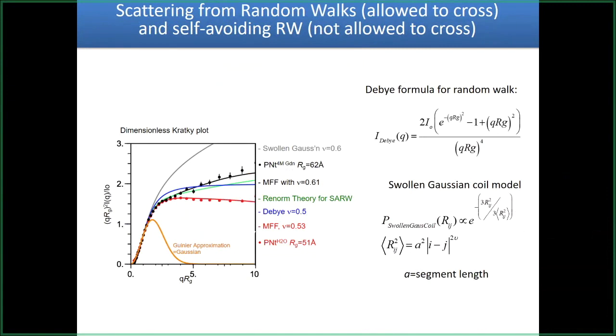It's been mentioned, but it hasn't really been touched. The hydration shows up in a variety of different ways. Even if I have a globular protein, water can't get within the radius of a water molecule. So in a sense, we have dense protein, and then there's nothing there, vacuum, right? And then we have water showing up, and the water will have some hydration shells, and sometimes you can actually see the g(r), the pair correlation function, go out with the water layering. If we're comfortable thinking about that, ask what happens when I have an unfolded protein? The same sort of effects are going to happen. The water's going to be around it. You have plus charges, minus charges.